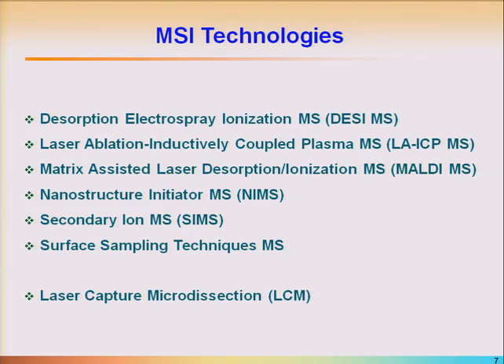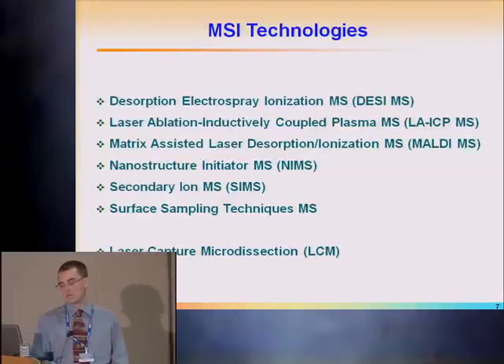So today I will talk about the following MSI technologies as they apply to drug discovery and development, with a specific emphasis on the third one, which is MALDI. But let's start at the top. Desorption electrospray ionization, laser ablation, inductively coupled plasma MS, matrix-assisted laser desorption ionization, MALDI, nanostructure initiator mass spec, secondary ion MS, surface sampling techniques, and then although it's not an imaging technique, I also want to touch upon laser capture microdissection.